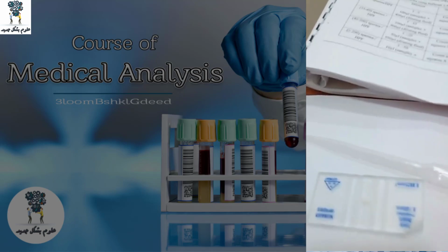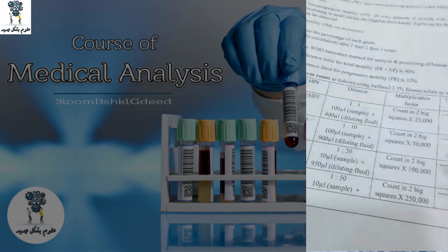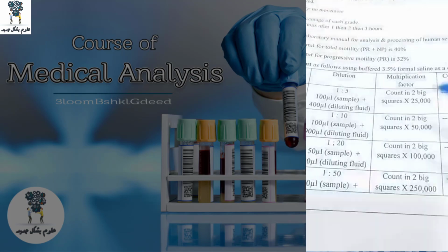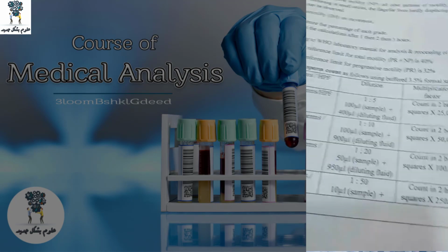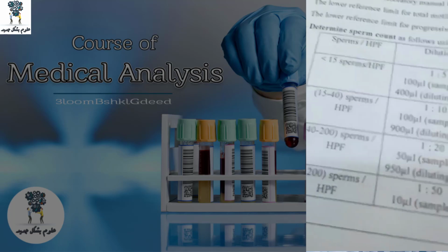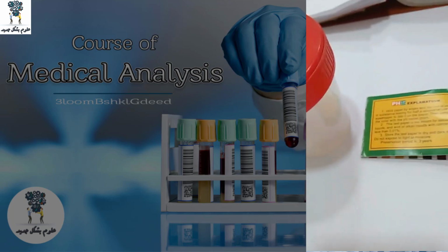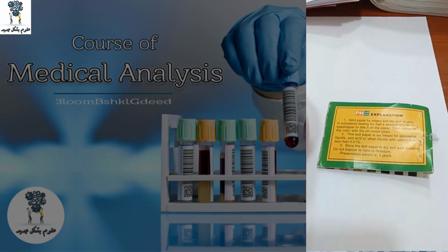After that, you will count 2 big squares, and then we will multiply by the factors suitable to the count. I will show you the final report.